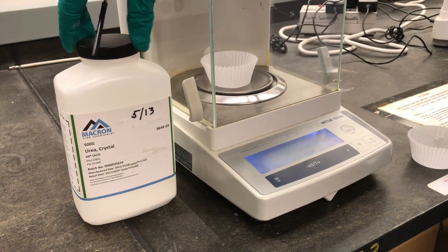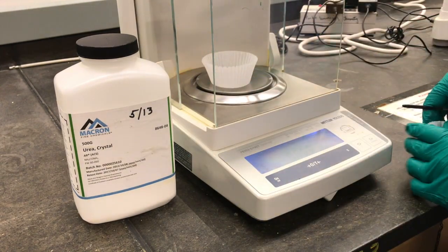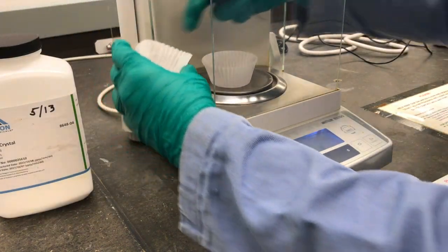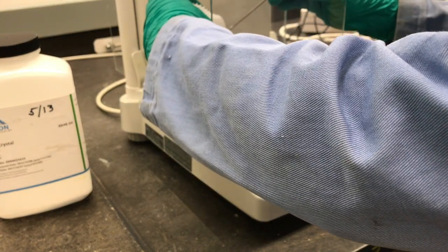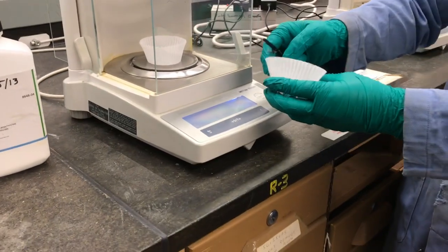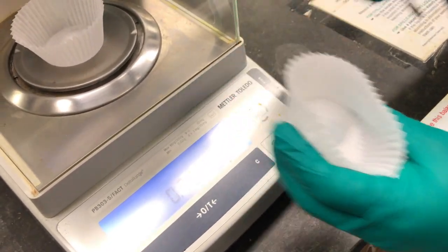Alright guys, so first we're going to measure out the urea. So we want to get as close to 0.75 grams. So I tared this little weigh boat here, and then we're going to see how close we can get to that. So we got about 0.768 grams, and if you want to get a close-up, this is what the actual solid looks like. You can see it's a white powder.